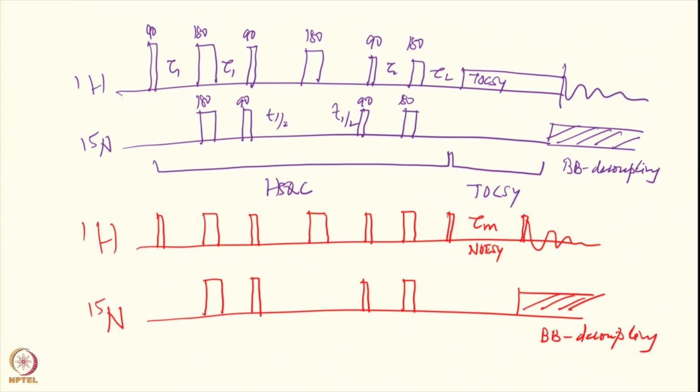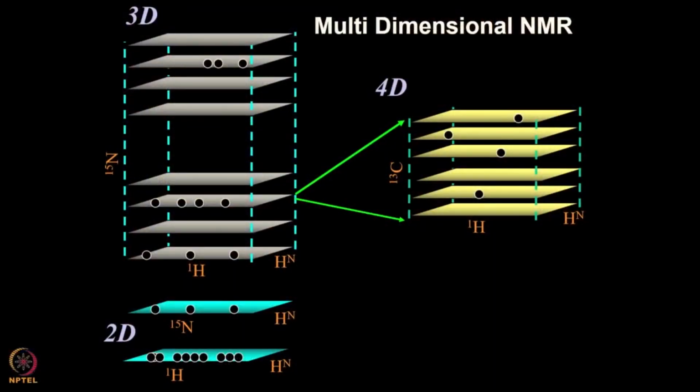Now let us see, we can go forward in a little bit more complicated situation. Okay, here we extend it. Now how do we use this, combine this to improve the experimental resolutions? Okay. Now we combine two kinds of 2D spectra and generate a 3-dimensional experimental sequence. A 3-dimensional experiment, how is it produced? A 3-dimensional experiment is produced by doing a 3D type of time data collection. So 3D experiments.